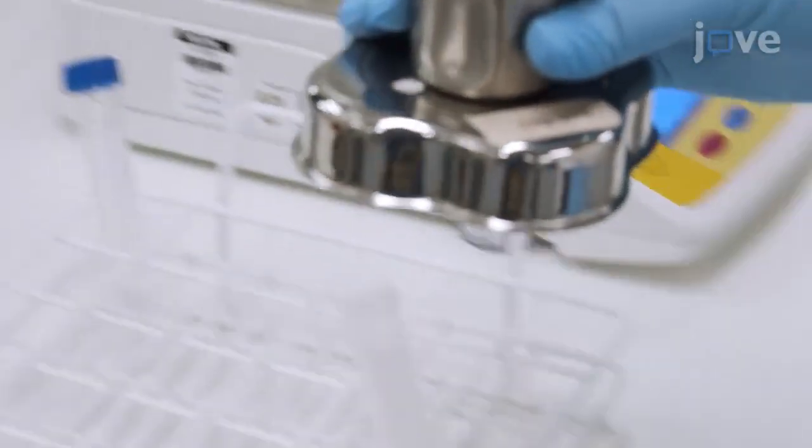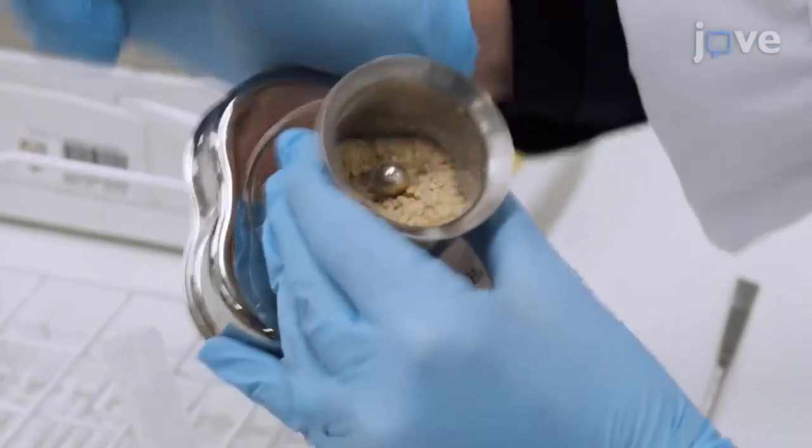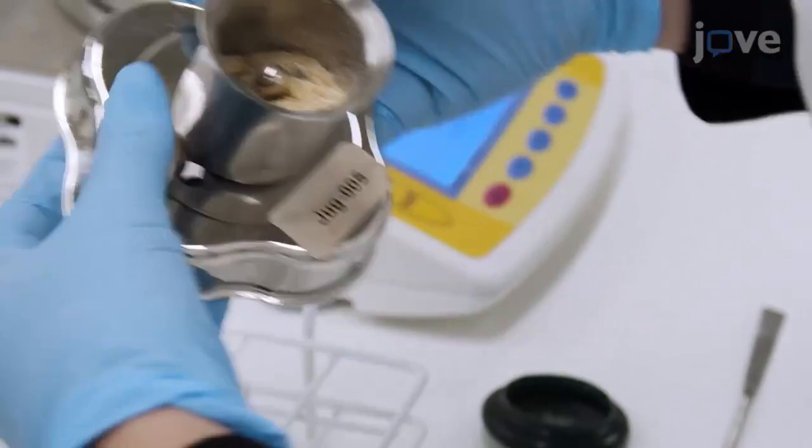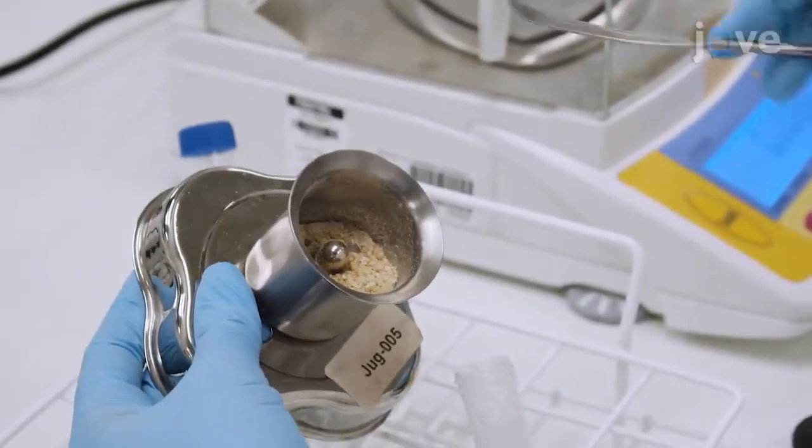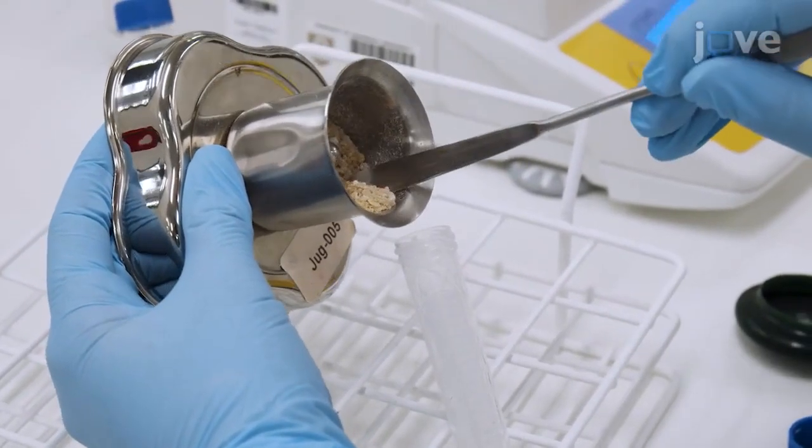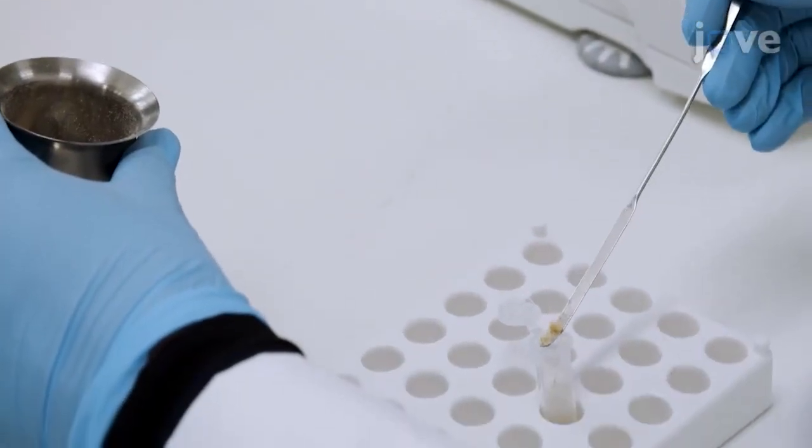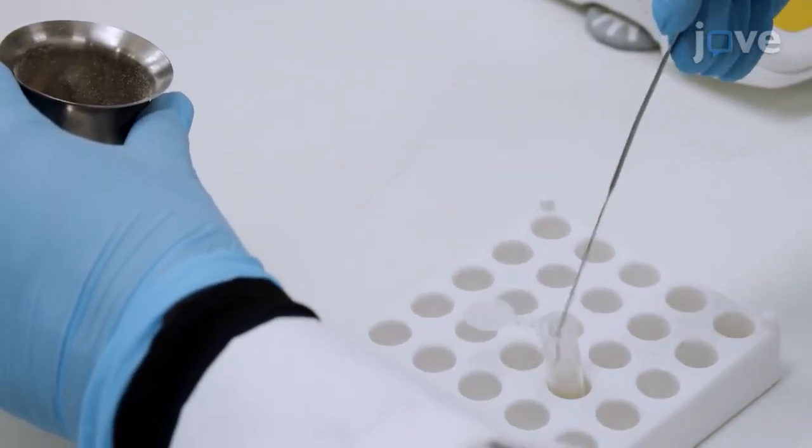Remove the blender jar from the base. Tap the side of the blender jar to bring any coarsely ground grain to the surface of the sample. The coarsely ground grain can be discarded or stored. Transfer the finely ground grain from the blender to a 2ml plastic microcentrifuge tube.